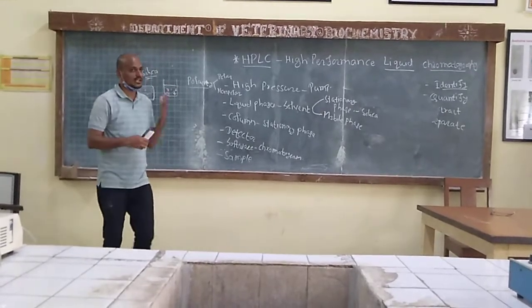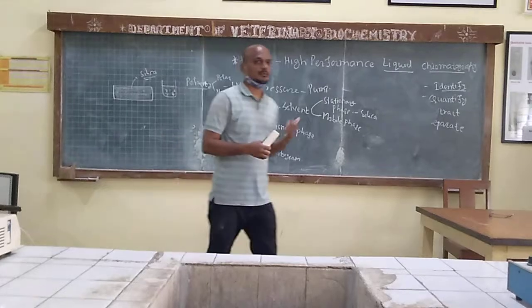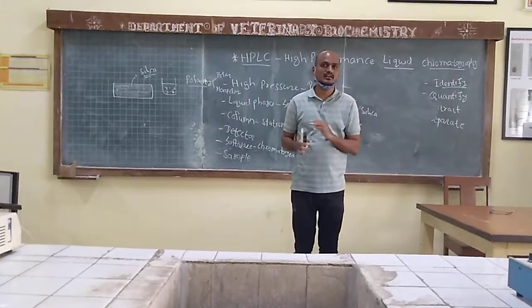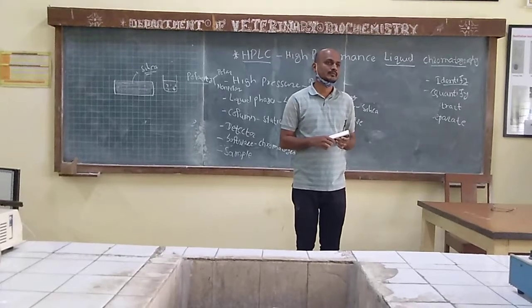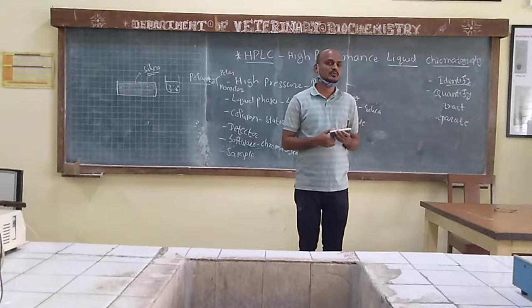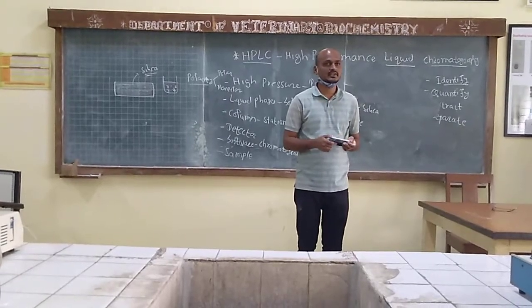So when we say polar, what do you understand by polarity? What is hydrophilic and what is hydrophobic? Hydro is water, and phobia is fear.